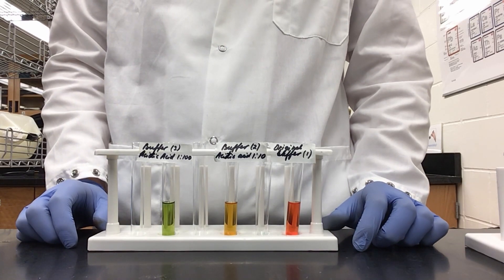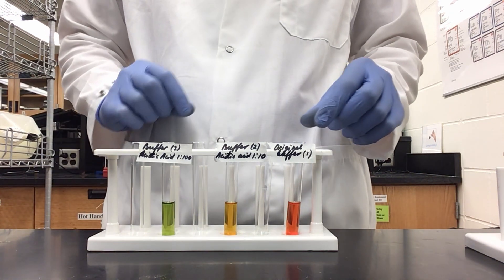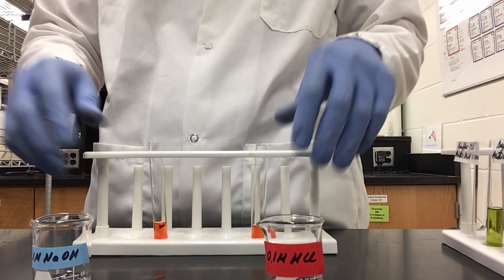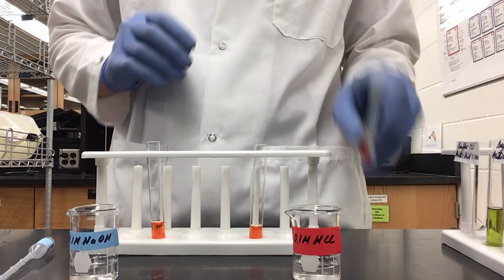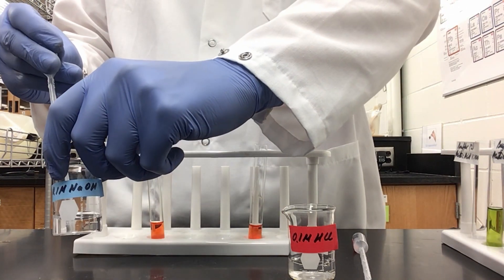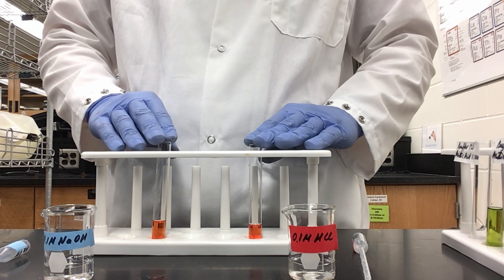Next we will repeat what we just did with boiled water and indicator, but using our original buffers. I have my original buffer of equal parts acetic acid and sodium acetate. I'm going to divide it between these two test tubes equally. Since these buffers already have indicator in them, I do not need to add any universal indicator. To my left test tube of buffer, I will add five drops of hydrochloric acid, and to the right, five drops of sodium hydroxide. As you can see, the color of both buffers did not change whatsoever, meaning there was no pH change and our buffers functioned as expected.